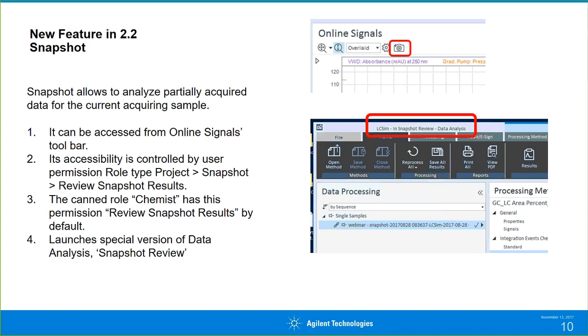Okay. One thing to point out in this is the user has to have permission to do this. For the demo and the system you're going to see online today, I don't have logins. I don't have individual users. But if you're working in a lab that's regulated, each user has to sign in. The user has to have permission to be able to access and open up a snapshot, because what happens when you have a snapshot is you're creating another file, right?